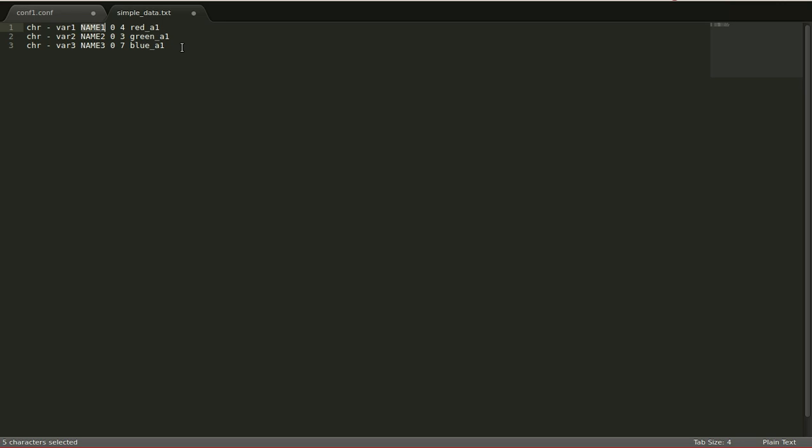Then you define the label of it. The identifier is going to be used only to make a reference or use any advanced configuration for this part. And the label is what is going to be shown in the plot or the chart.